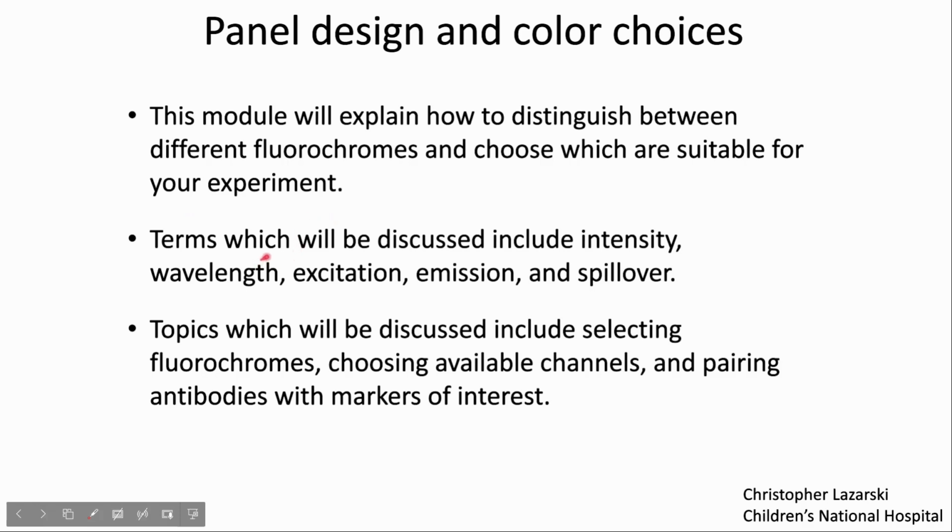And in this module, we're going to discuss terms including intensity, wavelength, excitation and emission, and spillover. Some topics which we will discuss include selecting fluorochromes, choosing available channels, making sure that the fluorochromes are not overlapping, and pairing antibodies with markers of interest.